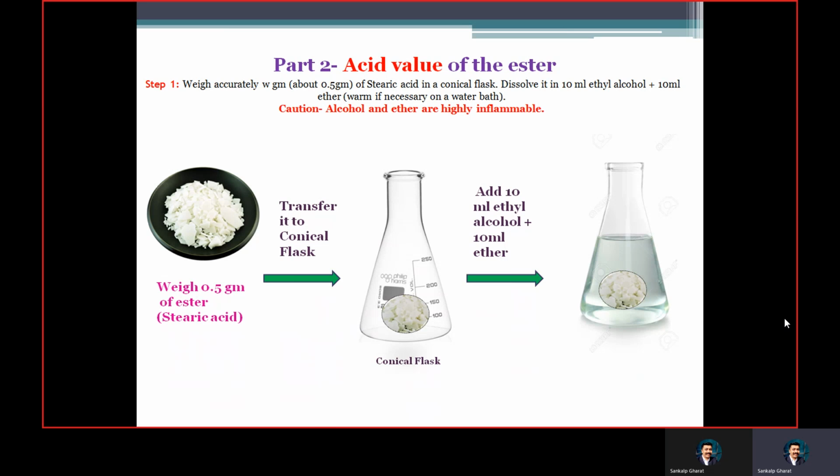Some amount of the stearic acid won't get dissolved. That is the reason we have to heat it using a water bath. There is a caution over here, students: as it contains alcohol and ether, it is highly inflammable. Just for the purpose of dissolving the stearic acid and forming a solution, we are heating it using a water bath, but you have to take utmost care during this time.